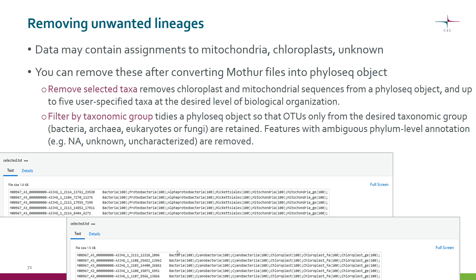If some of you have been using mothur before, usually at this step you would run the tool Remove Lineages. In Chipster we don't do that, even if the data may contain assignments to things like mitochondria or chloroplasts. You can remove these after converting the mothur files into phyloseq objects, and I will talk more about this later.